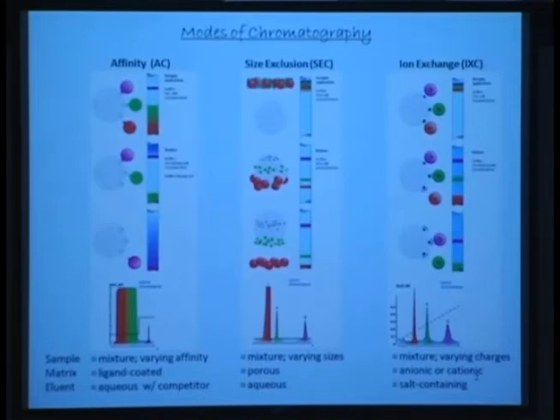These membranes have a molecular weight cutoff number listed. For example, something called 1,000 or 5,000 or 10,000, and likewise. So every molecule that is less than 1,000 would be filtered off for this one. Every molecule that is less than molecular weight 5,000 would be filtered off. Okay?